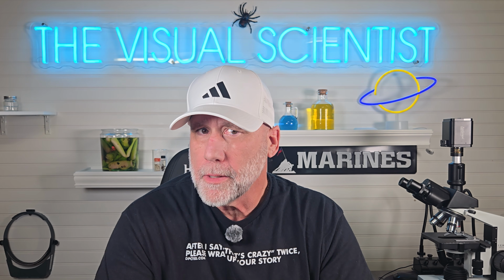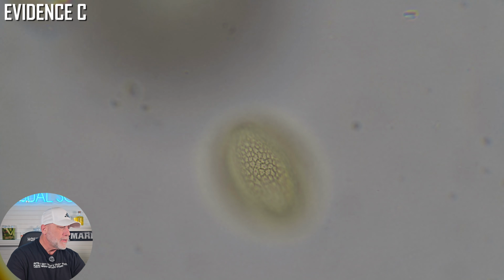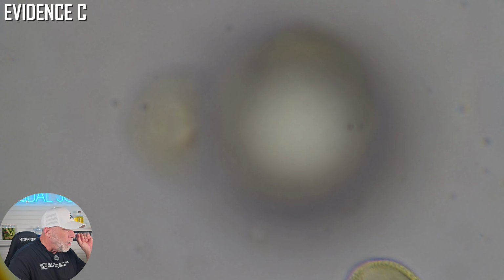Is that good or bad? I don't know. So let's go to 400 times. Whoa, this is a very different slide. Look at the density of this. Look at the irregular patterns. Look at all the material distributed through this sample.